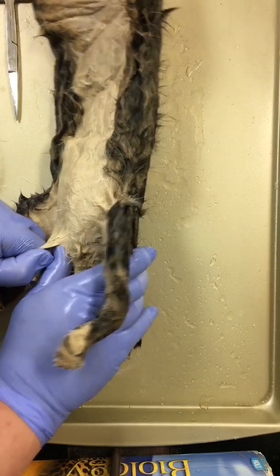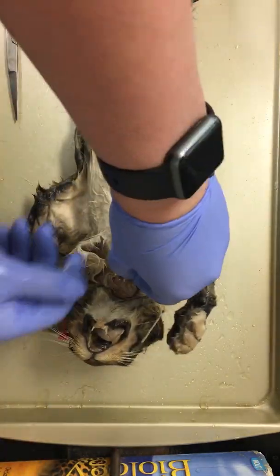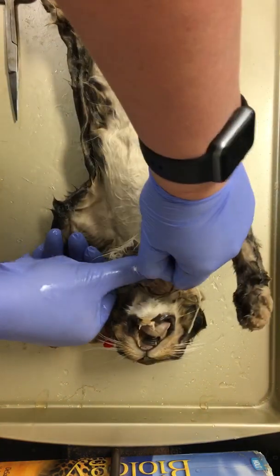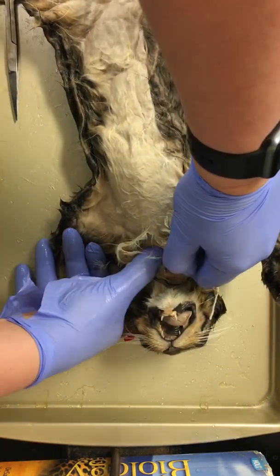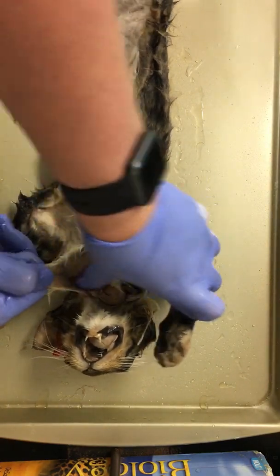The dermal layer is the only one that has blood. Your epidermis is actually not living — it is dead. And as we start moving, we can start separating things.